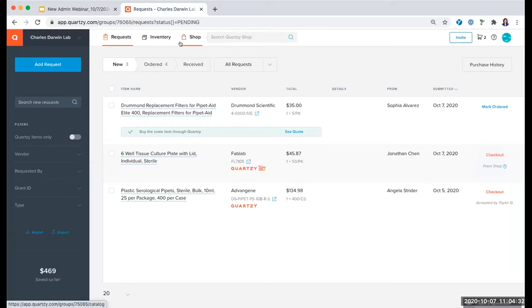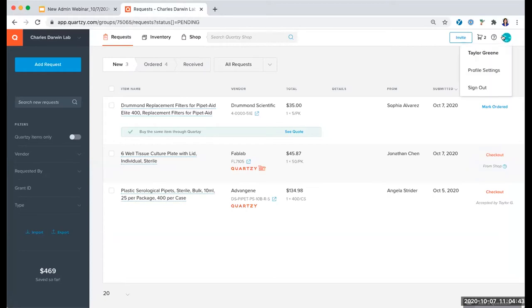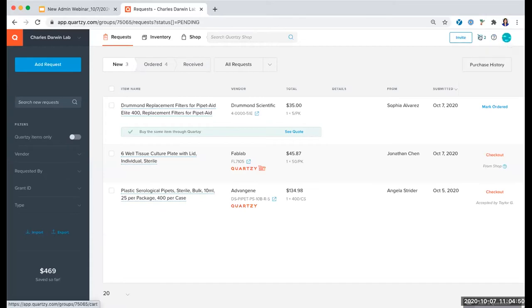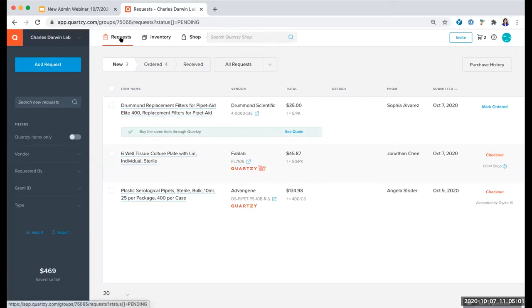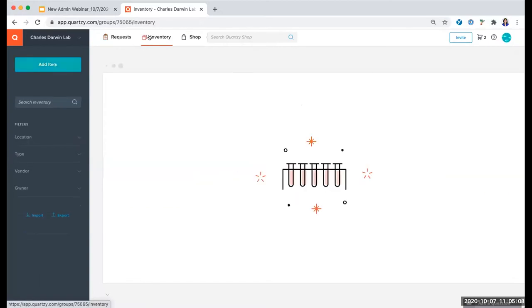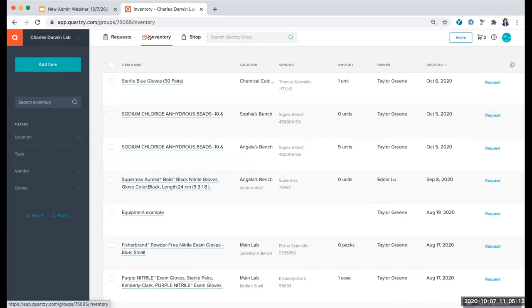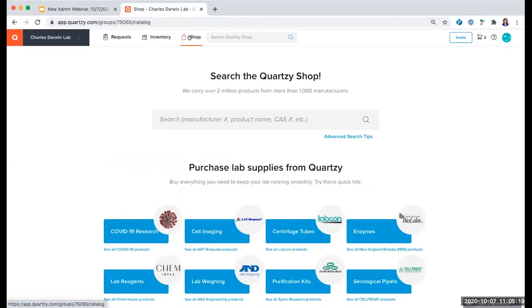I want to get started by first orienting you to your account and what you're seeing on the main page. When you log in, you'll notice your profile icon in the top right corner where your personal account settings are located. You also have the link to the Help Center and your cart is located here as well. On the top left side of your toolbar is where your lab selection and module settings appear.